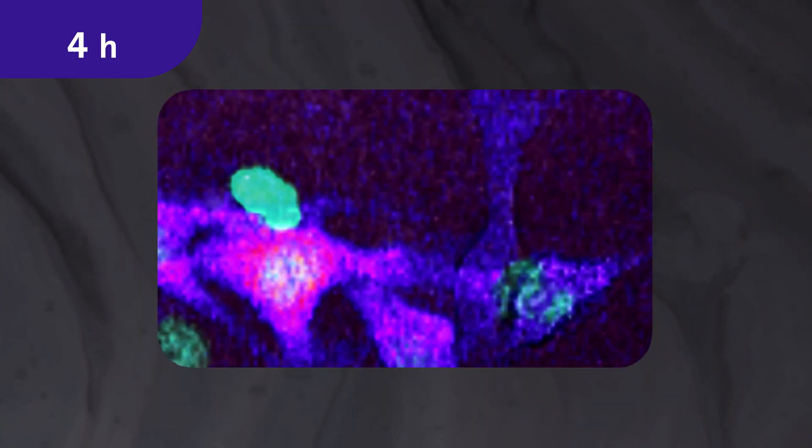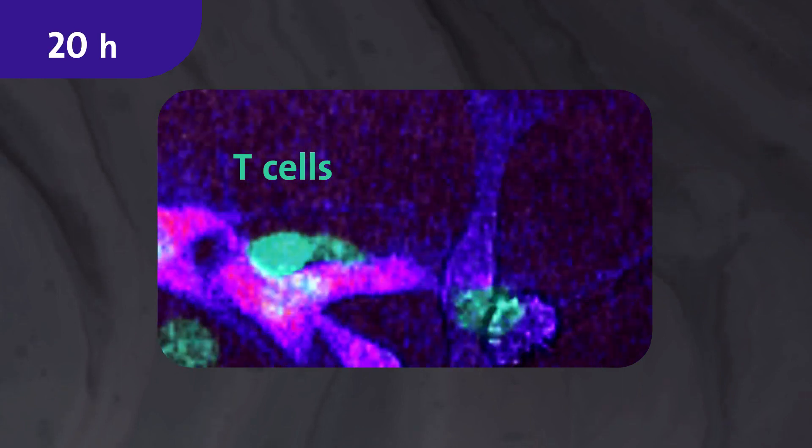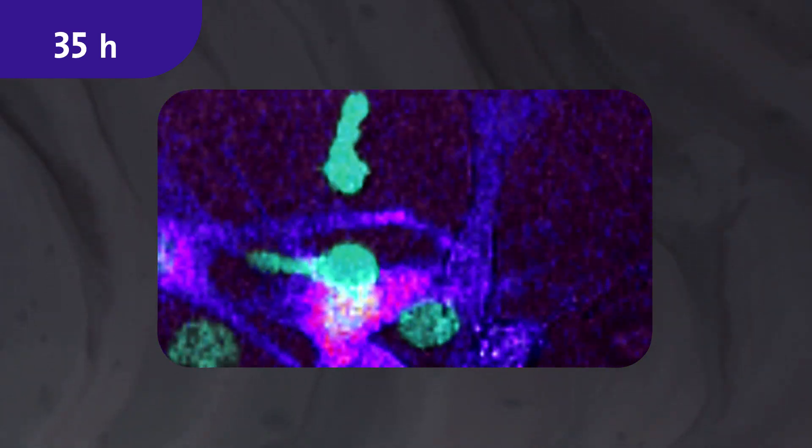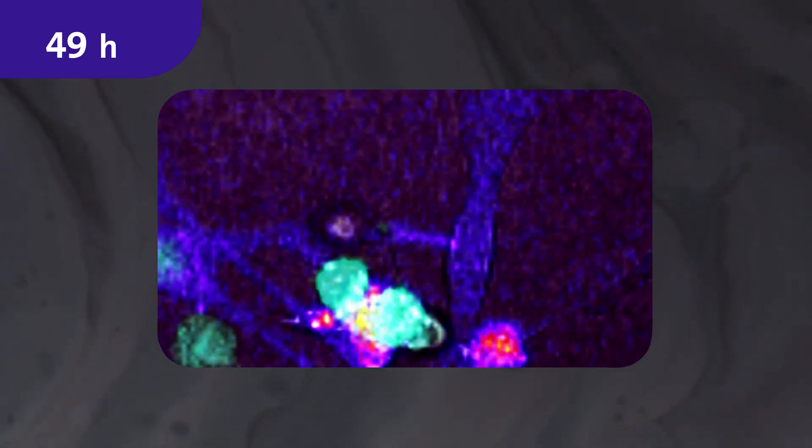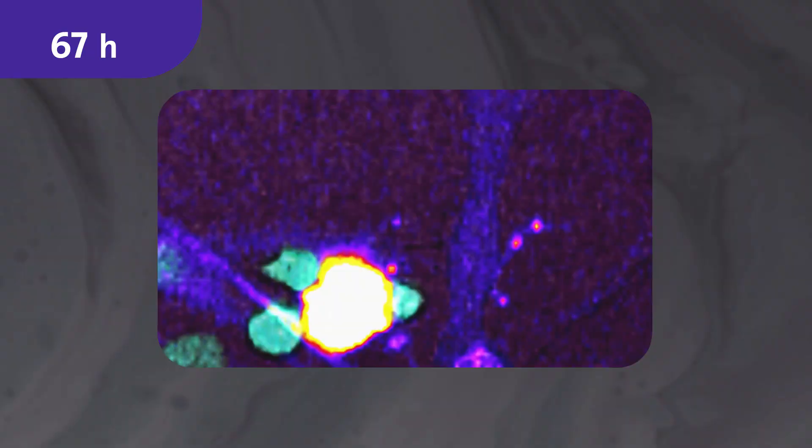Using time-lapse microscopy, we can see that T cells can hit tumor cells with several attack impulses during contact. Each impulse, akin to an injury, leads to varying degrees of calcium influx, visible in the video as a bright phase in the tumor cell. Here, the tumor cell collapses after the third impulse and disintegrates.